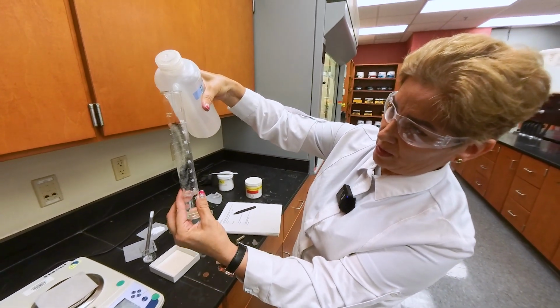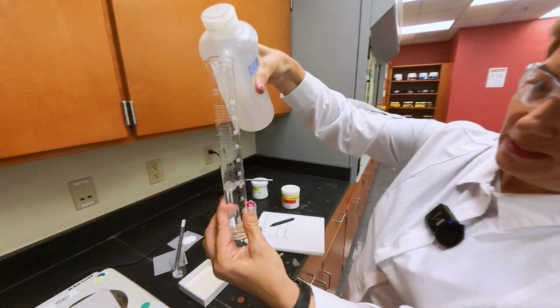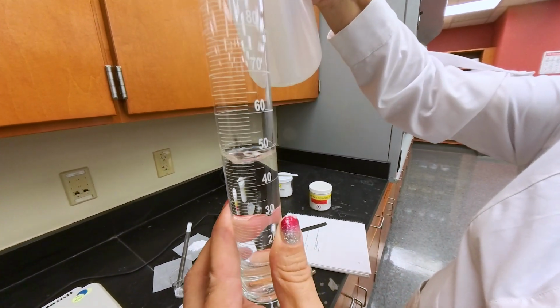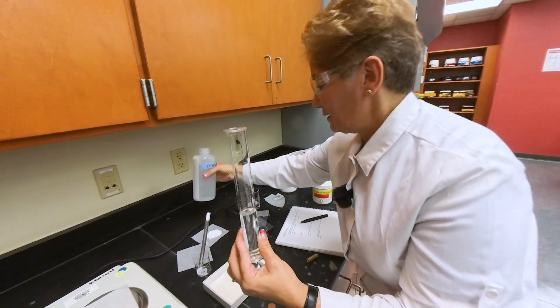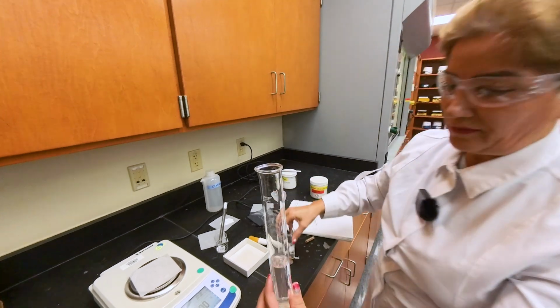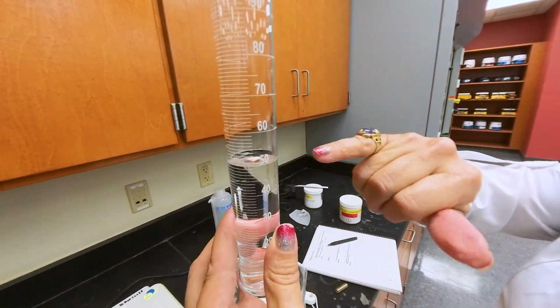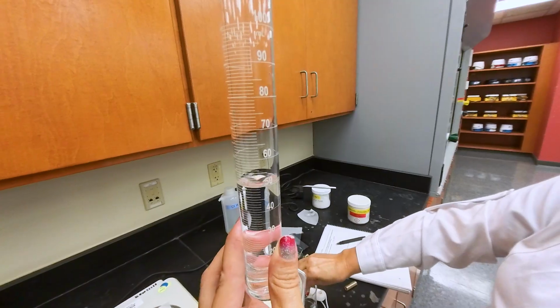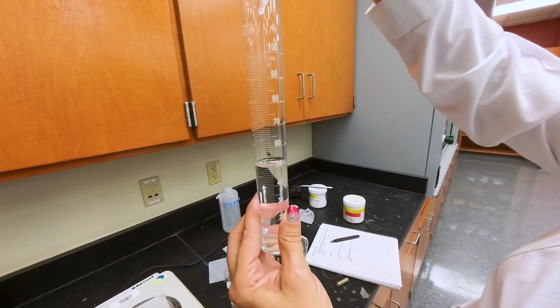Again, you want to go as close as possible to 50 and adjust the last drops by using a dropper until the meniscus, which is the lowest point of the curve in the liquid in the cylinder shape equipment, is aligned with a 50 milliliter mark.